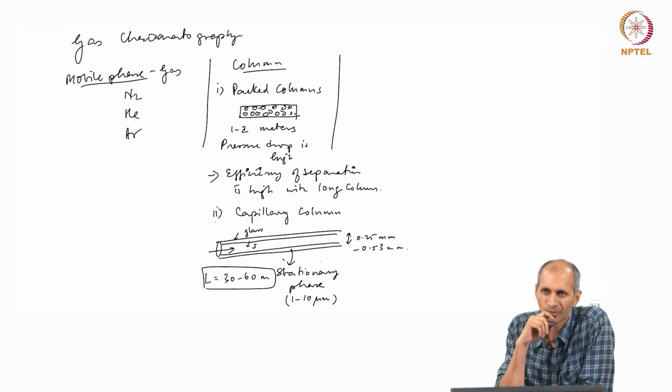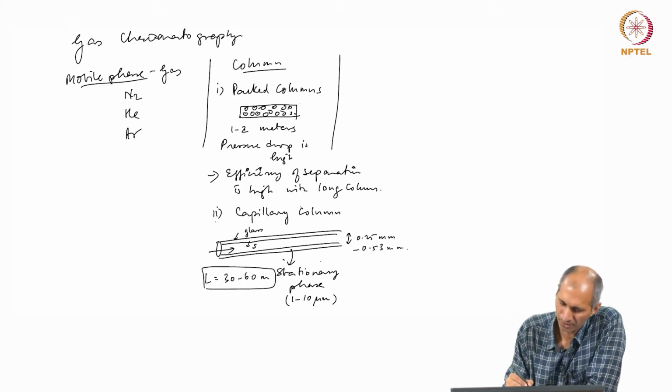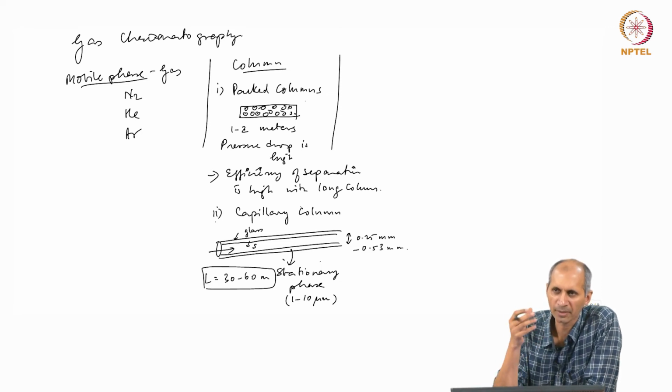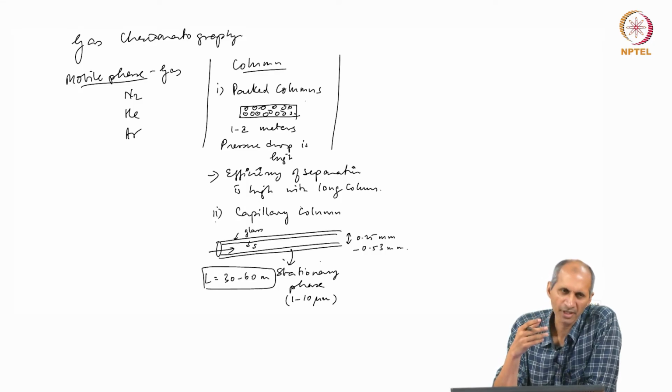Is the packing like the distillation column packing, or some other kind? It's just a simple packed bed. In the packed column, the stationary phase is usually spherical beads, which are commercially made. They may have some coating, or the entire bulk may be the material, because everything is happening on the surface.